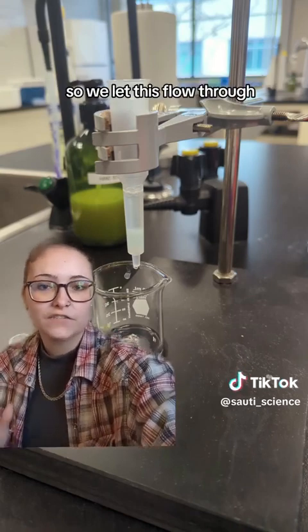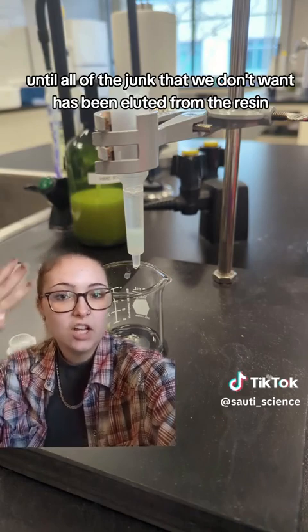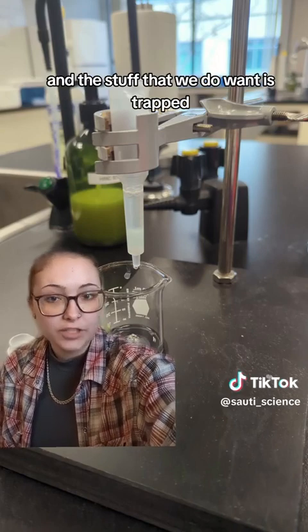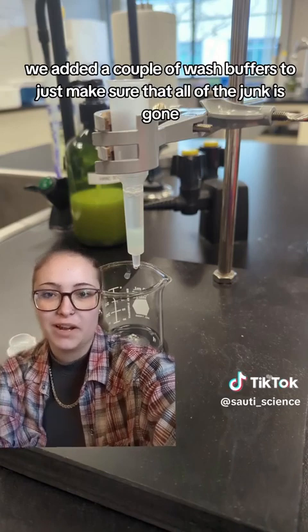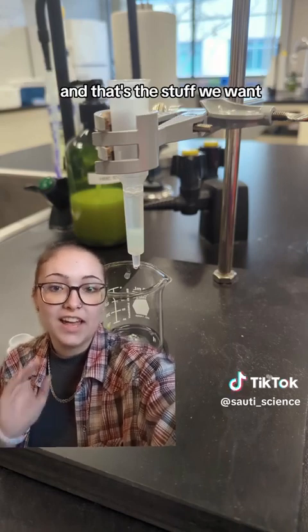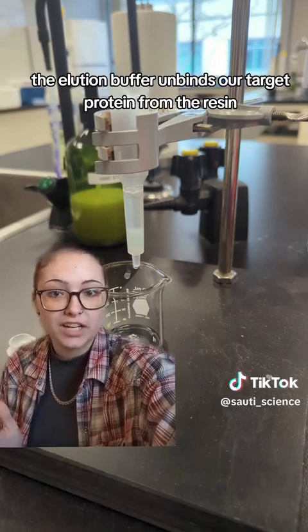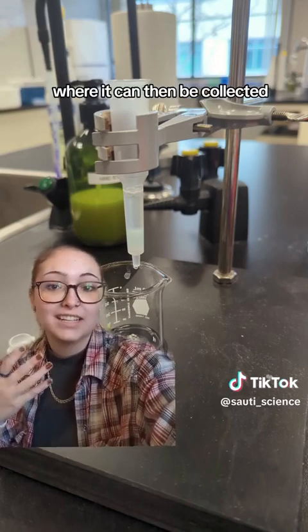We let everything flow through until all of the junk we don't want had been washed out of the resin and the target protein was trapped. We added a couple of wash buffers to make sure all the junk was gone, and then we added an elution buffer and let that flow through. The elution buffer unbinds our target protein from the resin, allowing it to drip out into a little tube where it can be collected.